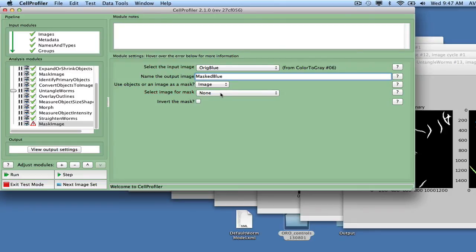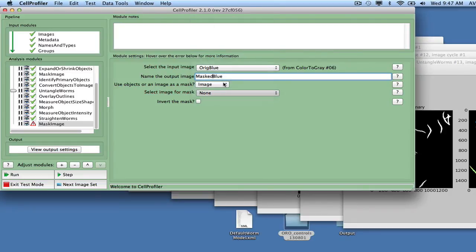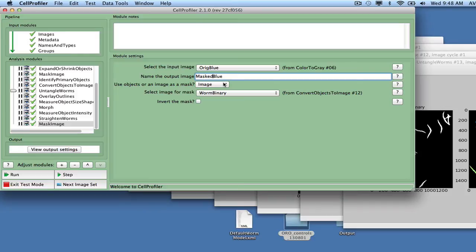The OrigBlue image is selected to define the fatty regions, since the Oil-Red-O staining has its greatest contrast in the blue image channel. The output of this module is called Masked Blue.